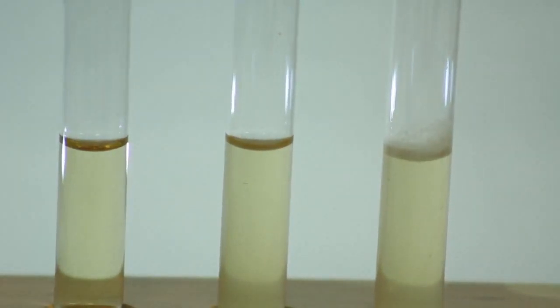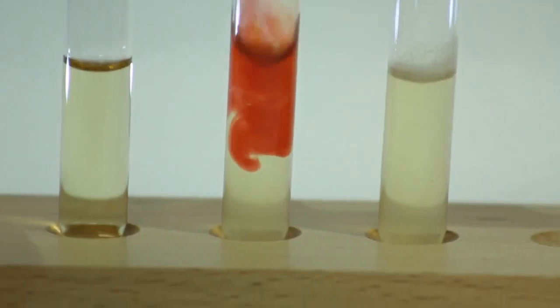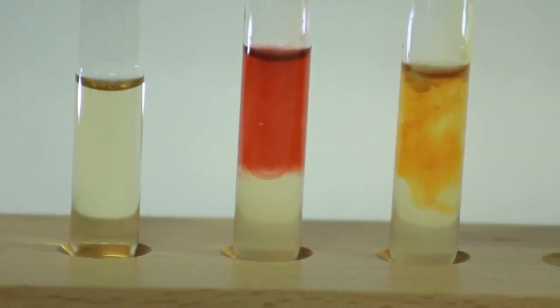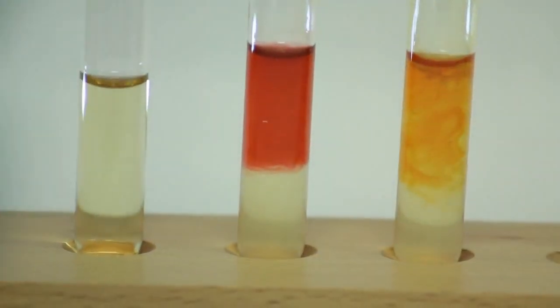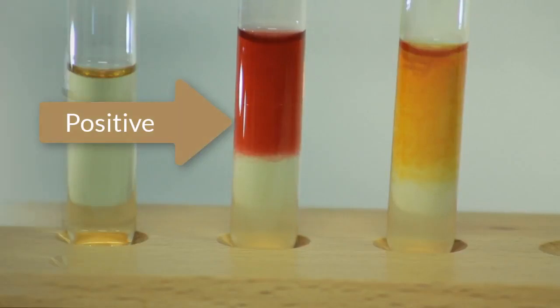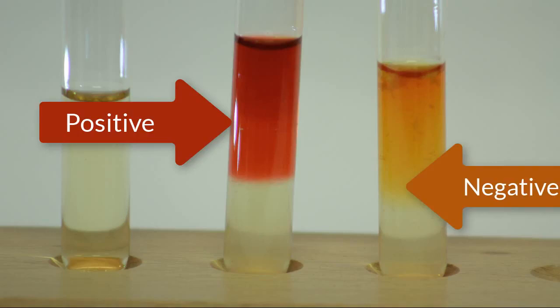You're going to use methyl red reagent — simply add several drops, I'm going to add 7 to 9. Notice the difference in the color reaction. A positive methyl red test will appear as bright red, while a negative test appears as kind of a dirty orange color.